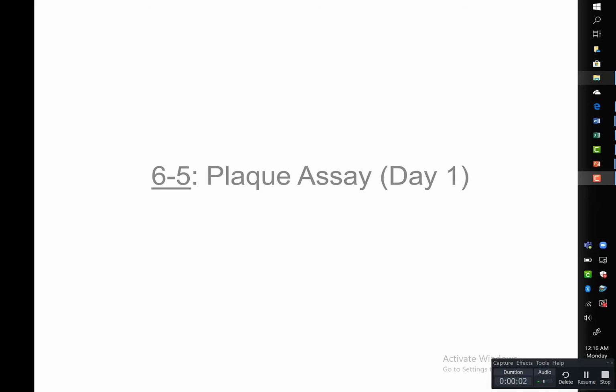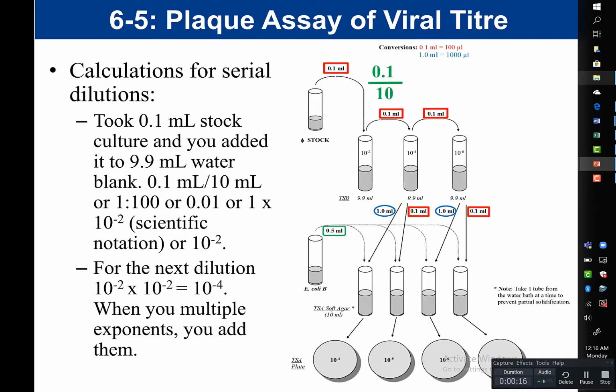So in this video, we're going to cover the plaque assay, which is activity 6-5. And we're going to start by talking about day 1, which is the setup for the plaque assay. So before we can talk about our plaque assay, we need to discuss how we set up this experiment.